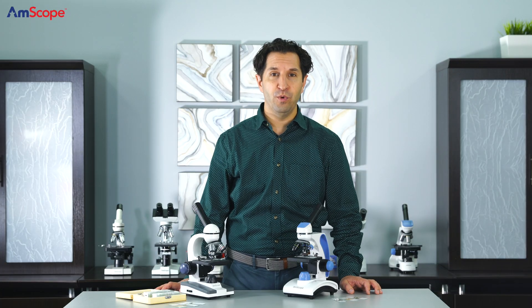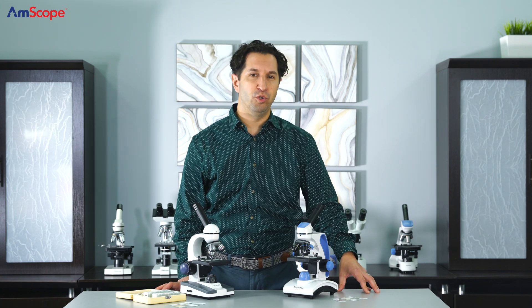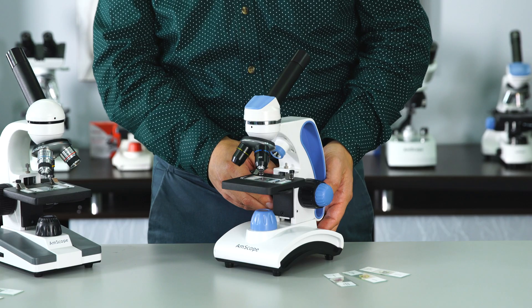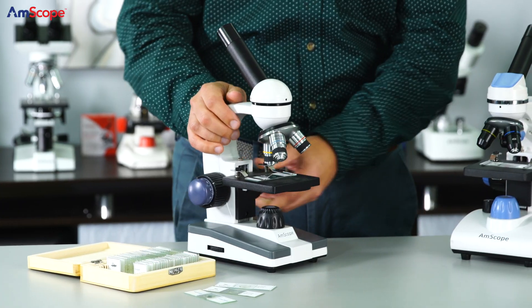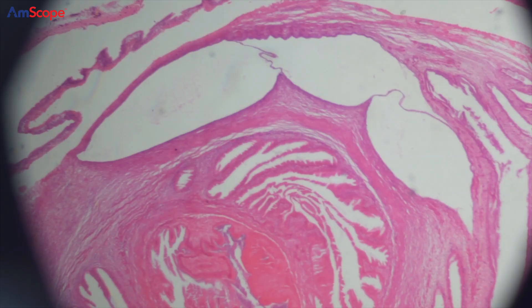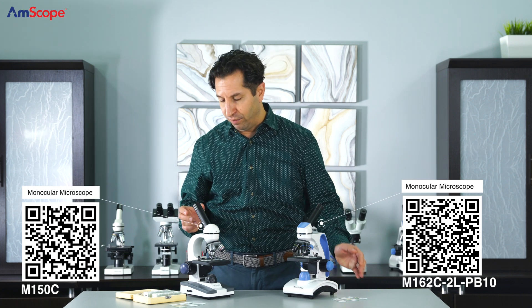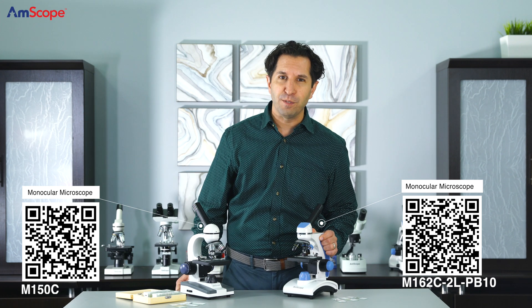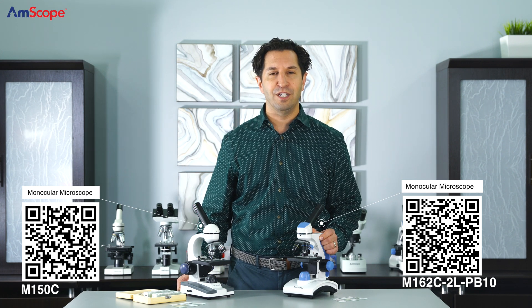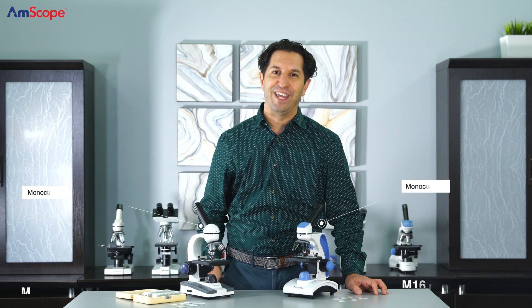Imagine teaching a unit on the differences between plant and animal cells. Our models for late elementary to middle school students, the M150 and the dual illumination M162-2L, are both solid selections. Students can collect their own cheek cells and use onion skins to prepare slides and see the differences through the eyepieces, really bringing those textbook images to life.